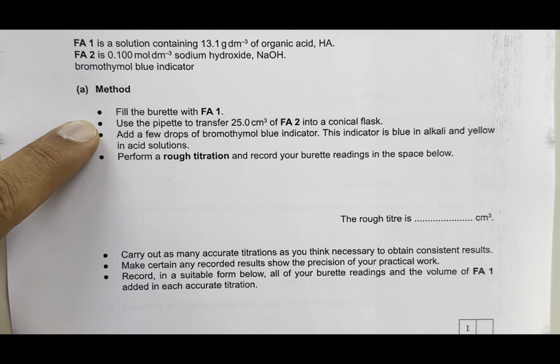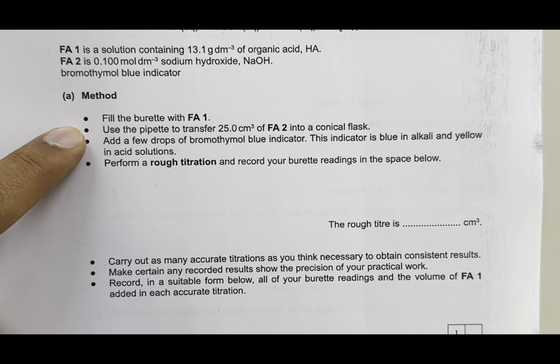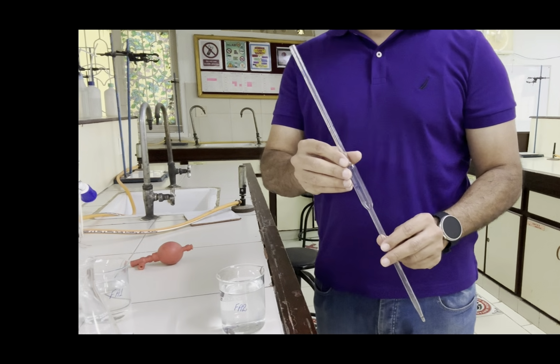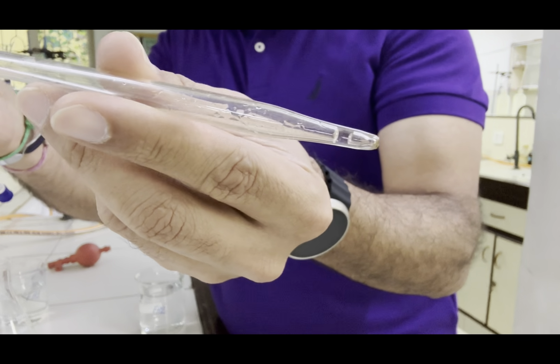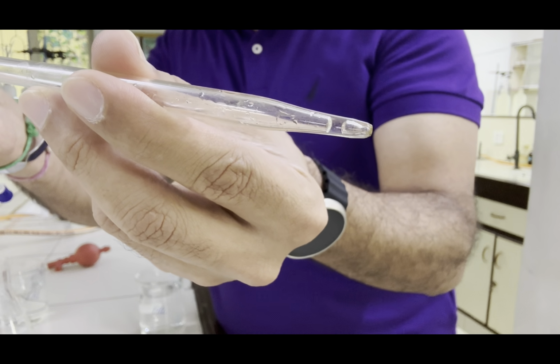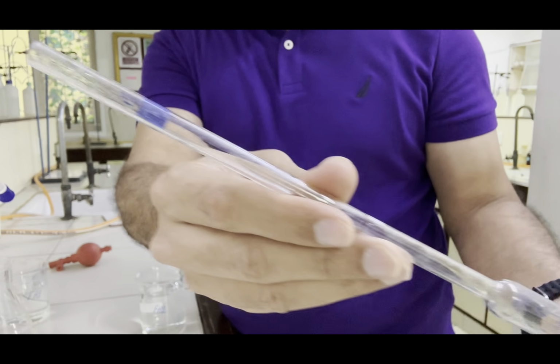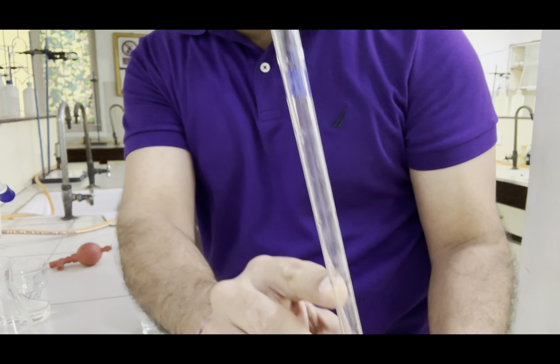Now the next point says use the pipette to transfer 25 centimeter cube of FA2 into a conical flask. This is our pipette. Pipette has two ends, one is narrow and the other one is broad. There is a mark from the broad end.